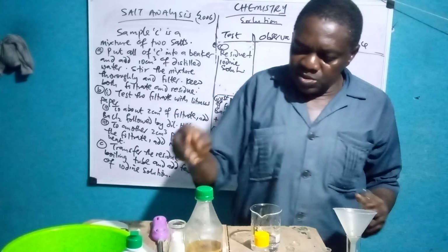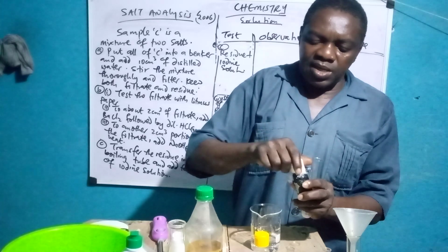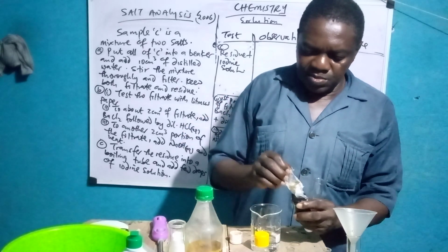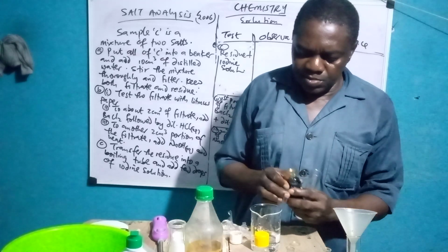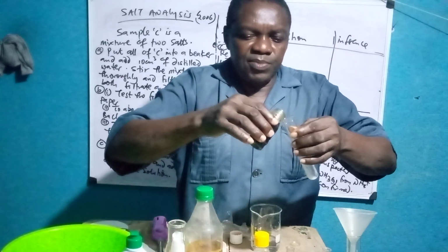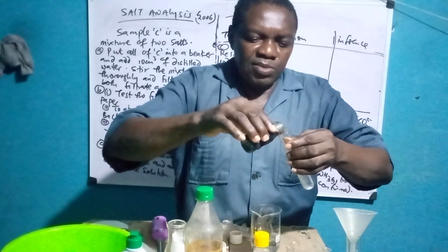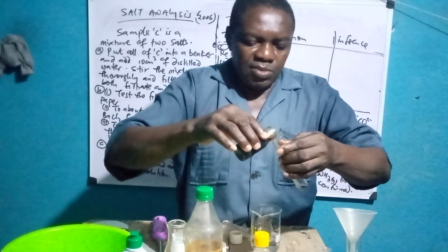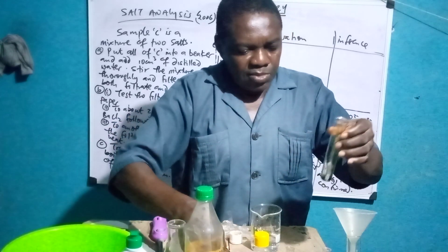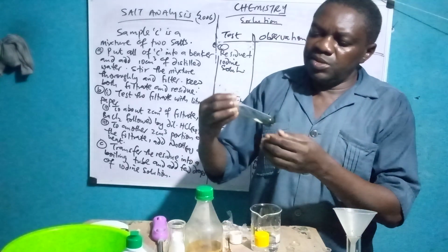So this is your iodine solution. You can add it and see what it gives us. Let's see. Just add a few drops. You can see it.